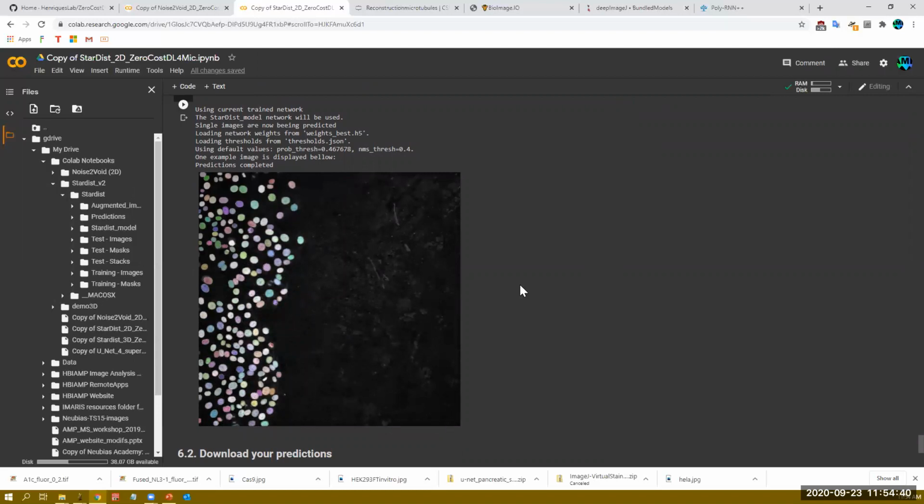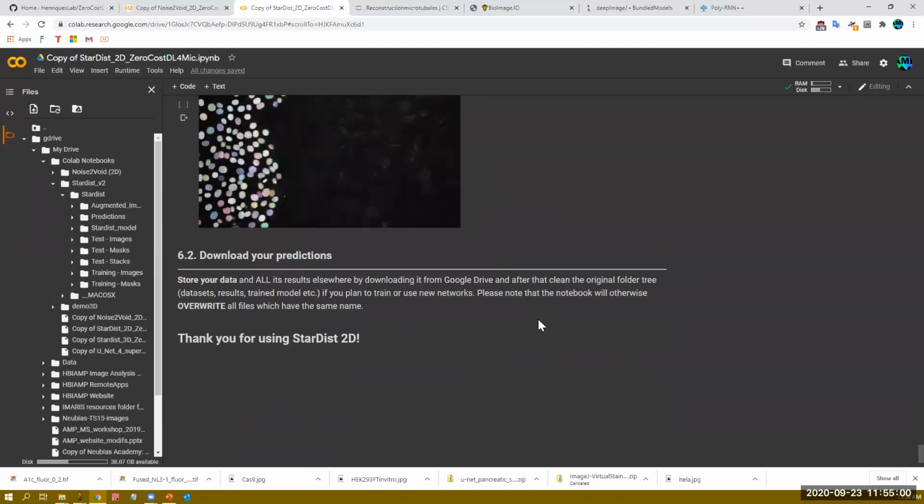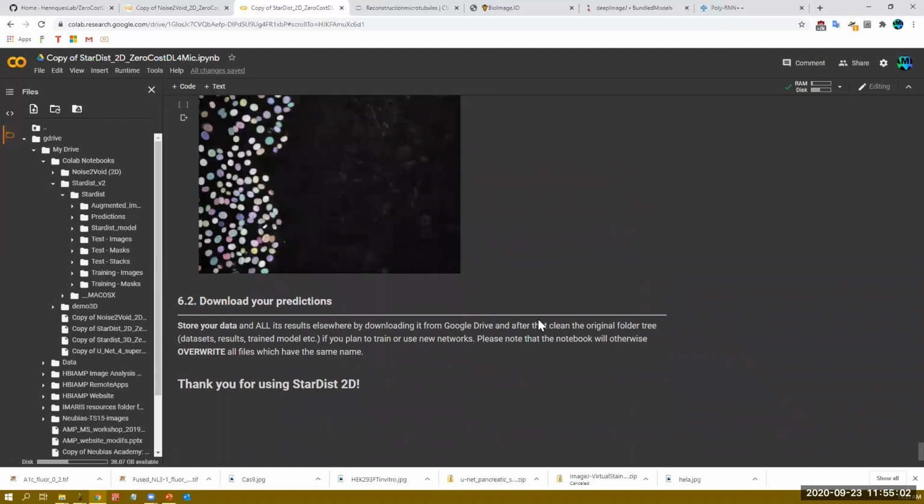So this deep learning network grabbed a random image and then segmented it, analyzed it, annotated it, and basically that should be as close, if not perfect, with how you would annotate it manually to begin with. So then that's it. It's pretty simple.